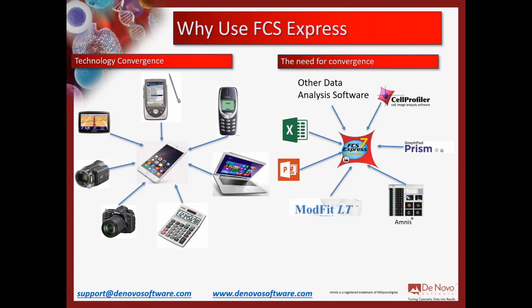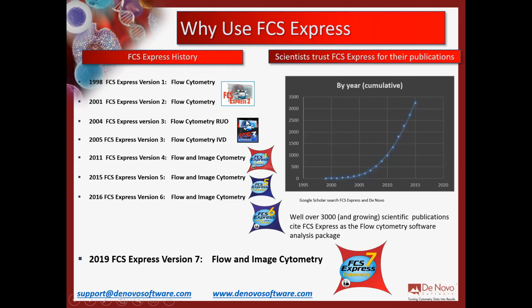So again, imagine moving a gate. If you're using another piece of software, you have to copy and paste the table out to Excel. You have to create a bar chart based off of that. In FCS Express, we just do it all in the software in real time, which is pretty nice.